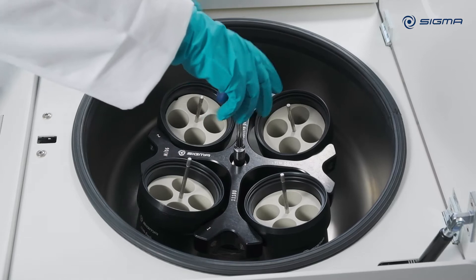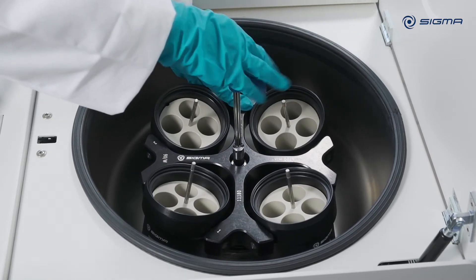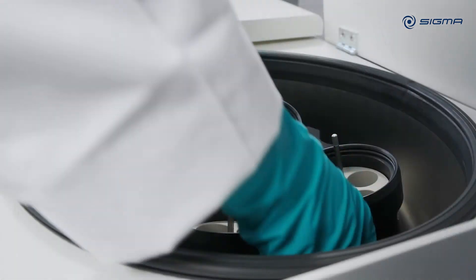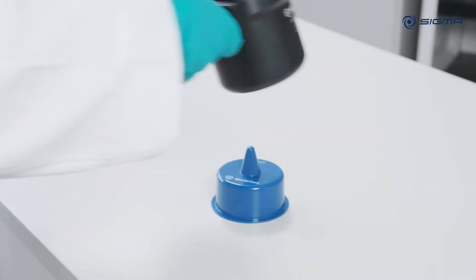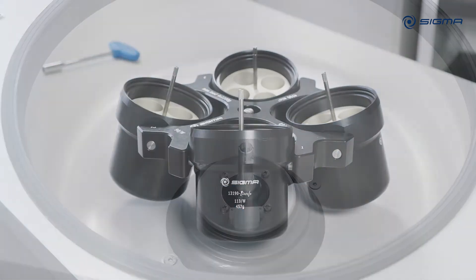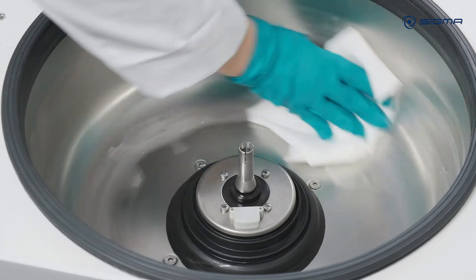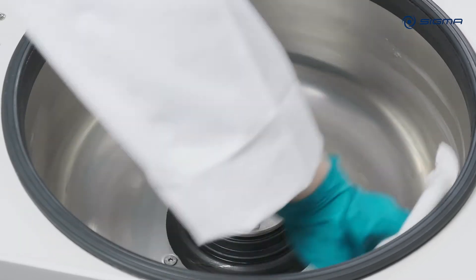To clean the centrifuging chamber, loosen the rotor screw and remove the rotor. Carefully remove any liquids from the rotor centrifuging chamber with a cloth.